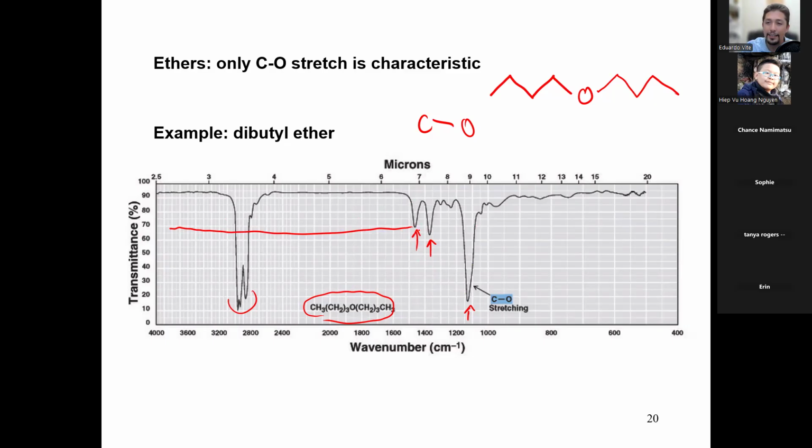That's not very intense. And a carbon-oxygen single bond is very strong, even when it's a single bond. So it's very intense. You still need a high intensity of energy to shake it. So carbon-oxygen bonds are always going to be intense. That's how you can tell which ones they are. Whether it's a carbonyl or a carbon-oxygen, they're going to be relatively intense. Make sense?